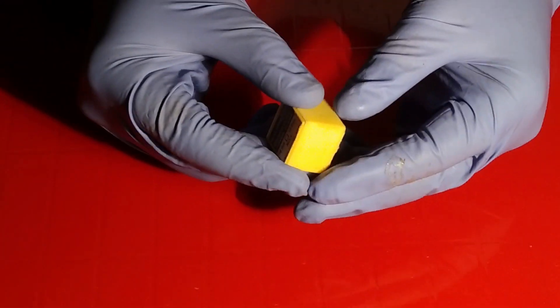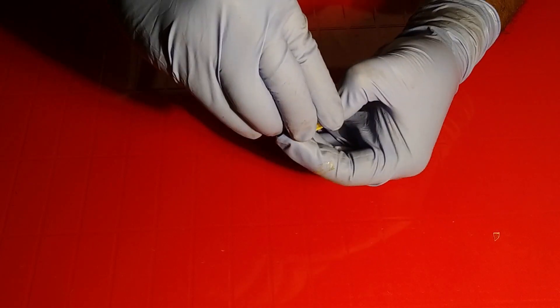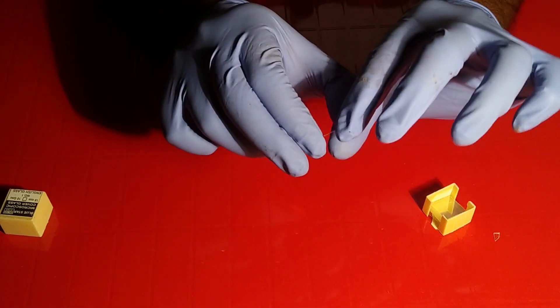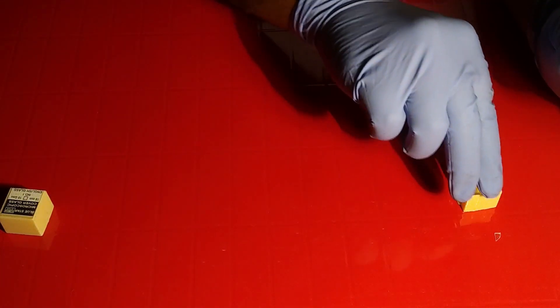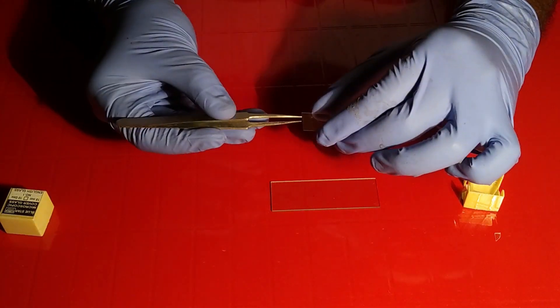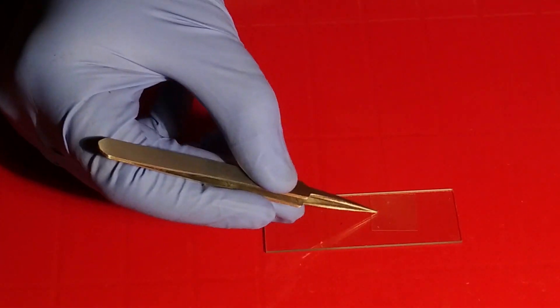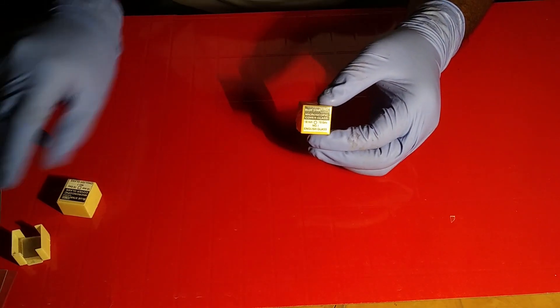For any unicellular organism, those groove slides help. Now, these are cover slips — 18 millimeter and 22 millimeter, different types are available. Here we are using a square cover slip. This is the way to transfer a cover slip onto any sample.